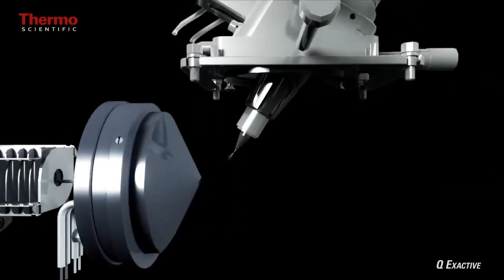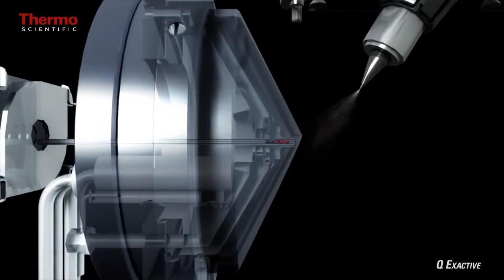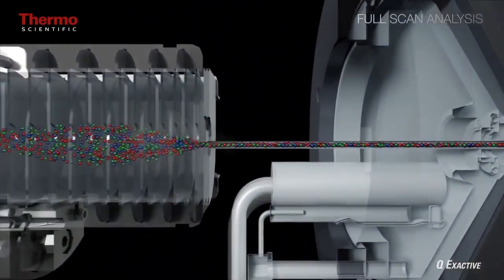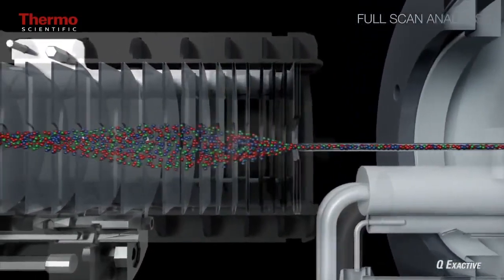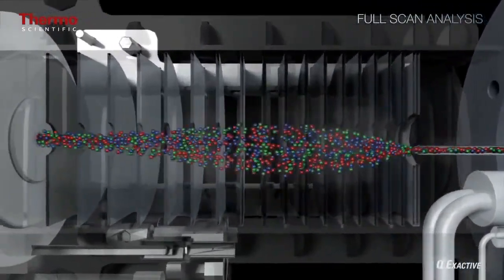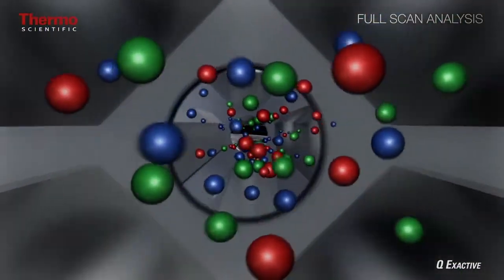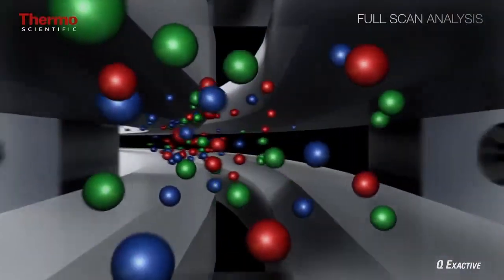In the full scan mode, ions are produced at the source. They are captured and focused for effective ion transmission using a variety of lenses. Uncharged neutral species at this point are filtered out using the bent flattopole.